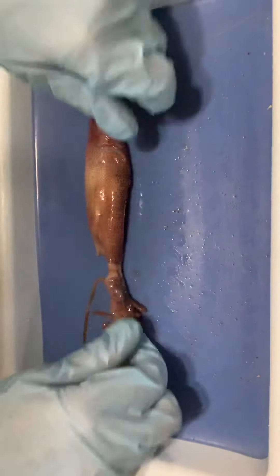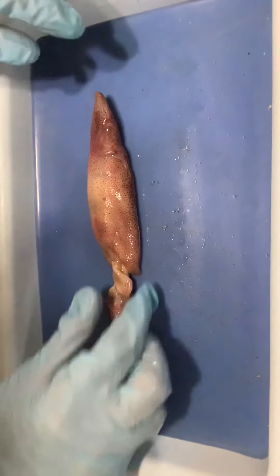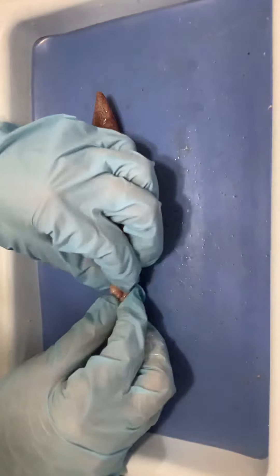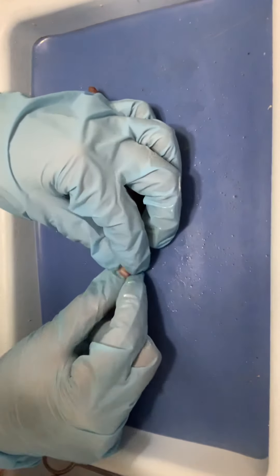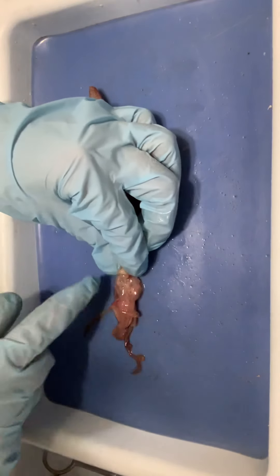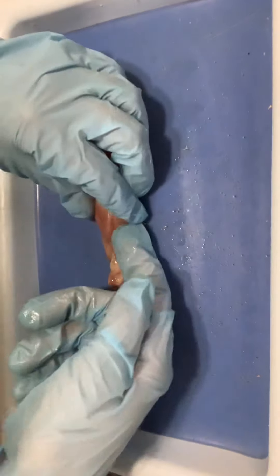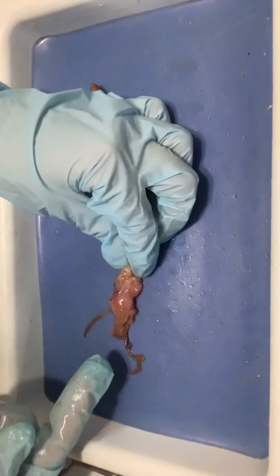If I flip this guy over, one of the most important body parts involved in locomotion is the siphon — also called the funnel — right there. That's where the water gets pushed out. Water gets taken into the mantle cavity and then pushed out through the siphon to allow for jet propulsion to occur.